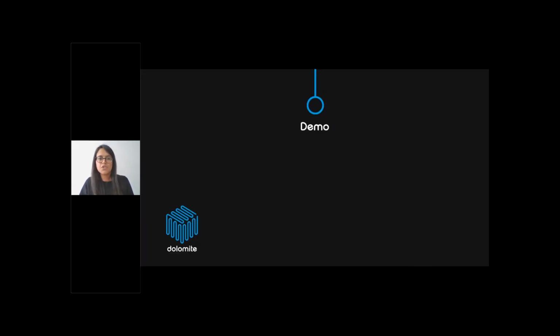So now I'm going to move on to just sharing with you a little system video talking through how the system actually works, and I've just used some few dyes for demo purposes. So just bear with me while I switch to that.